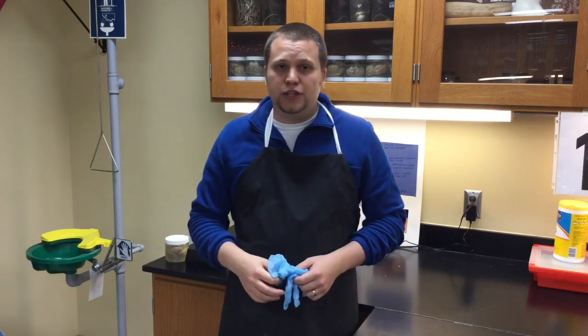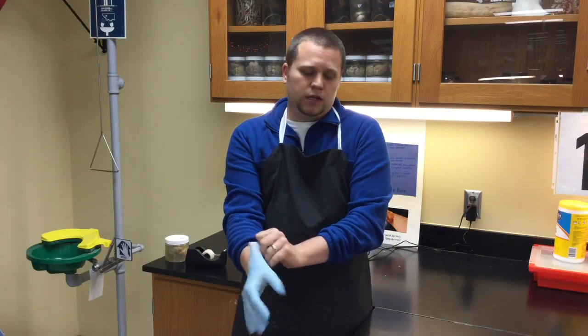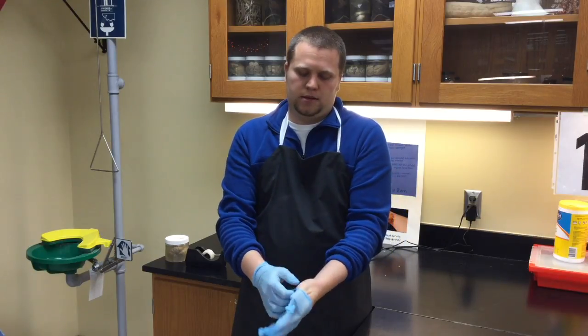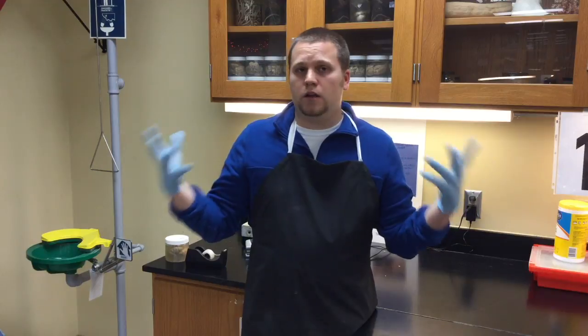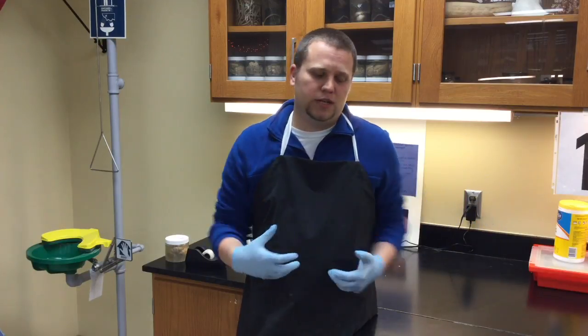The first thing that you're going to put on is called a lab apron. That also prevents your clothes from getting dirty as you are doing the dissection. The next thing that you're going to go ahead and put on, or don, is called the gloves. So you place one glove on each hand, like so. Now, if you are wearing long sleeves, I highly recommend that you roll them up, so that nothing gets into the brain juice as we are dissecting.